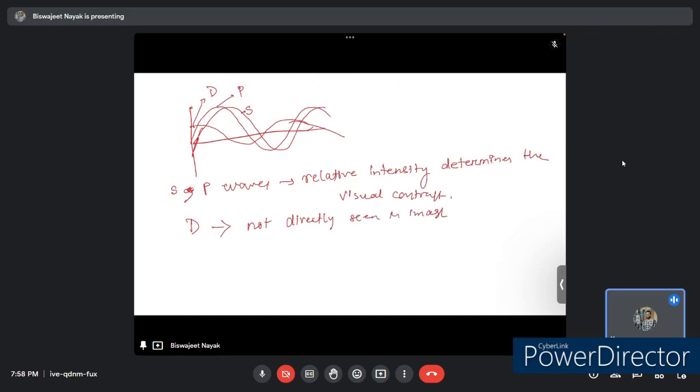The amplitude of each wave represents the sum of the electric field wave vectors of the photons which we are emanating over our object, and we are getting the image out of it. So here the D wave has lower amplitude than the S wave, because there are fewer D wave photons than S wave photons at the image point.